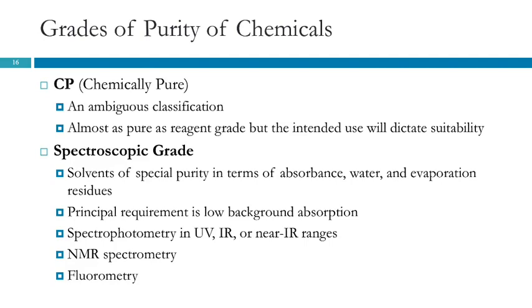CP stands for chemically pure. This is rather ambiguous, so the quality of that could vary. It's almost as good as the reagent grade, but what you plan to use it for will determine whether it's actually suitable or not.